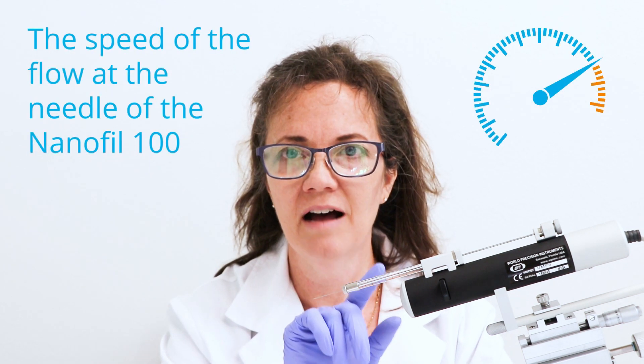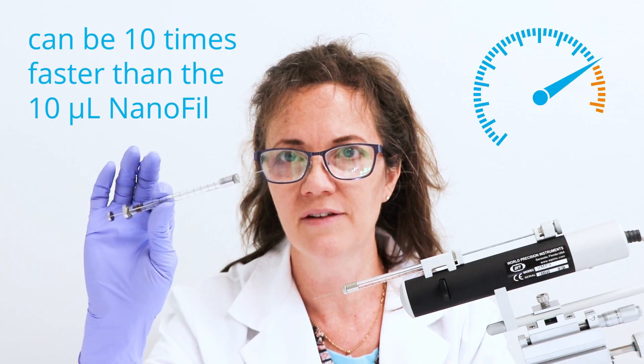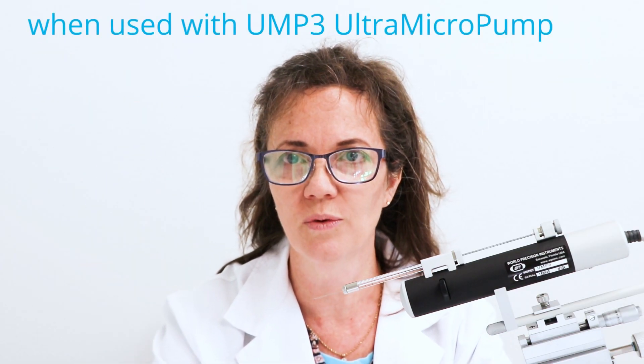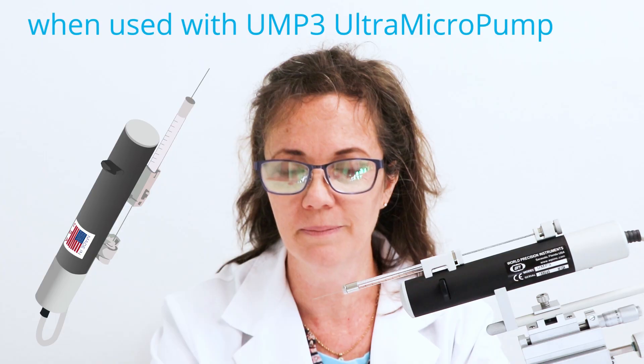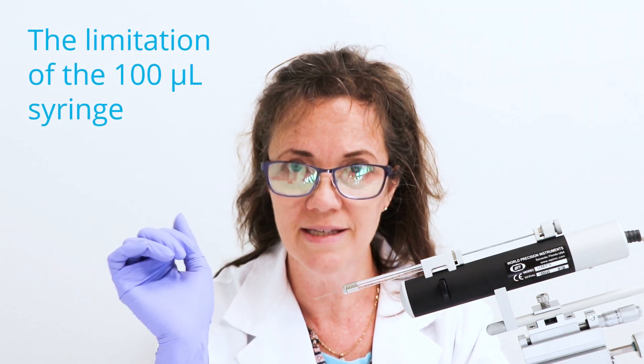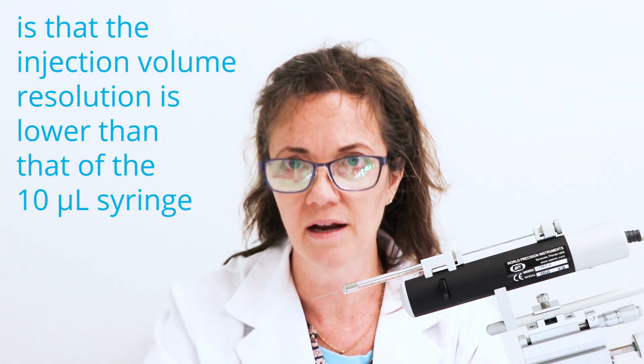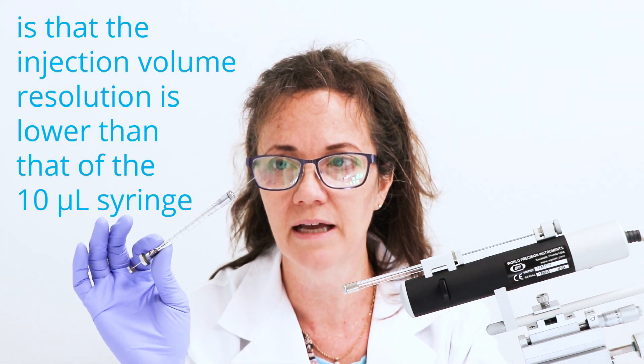The speed of the larger syringe can be 10 times faster than that of the Nanofil 10 microliter syringe when used with the UMP3 ultra micro pump. However, the limitation of the 100 microliter syringe is that the injection volume resolution is lower than that of the 10 microliter Nanofil syringe.